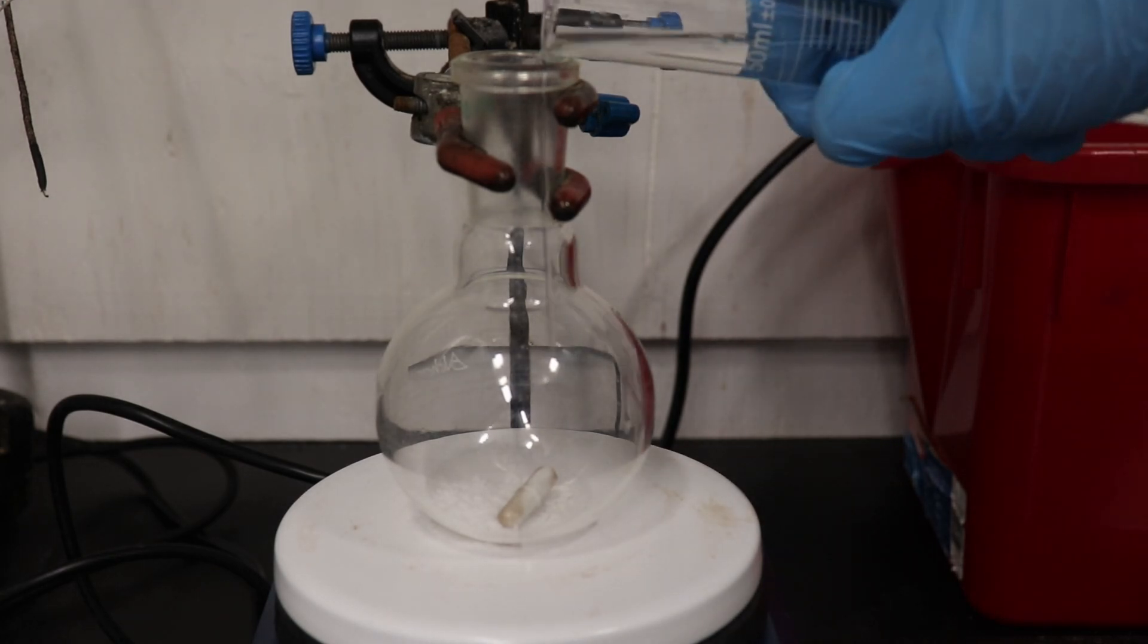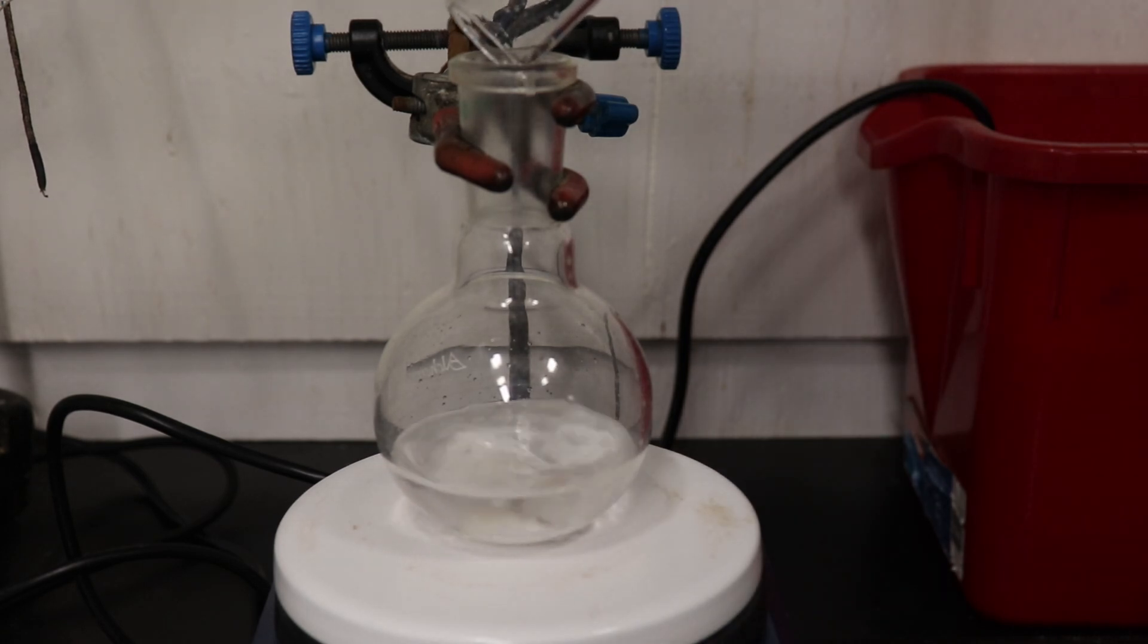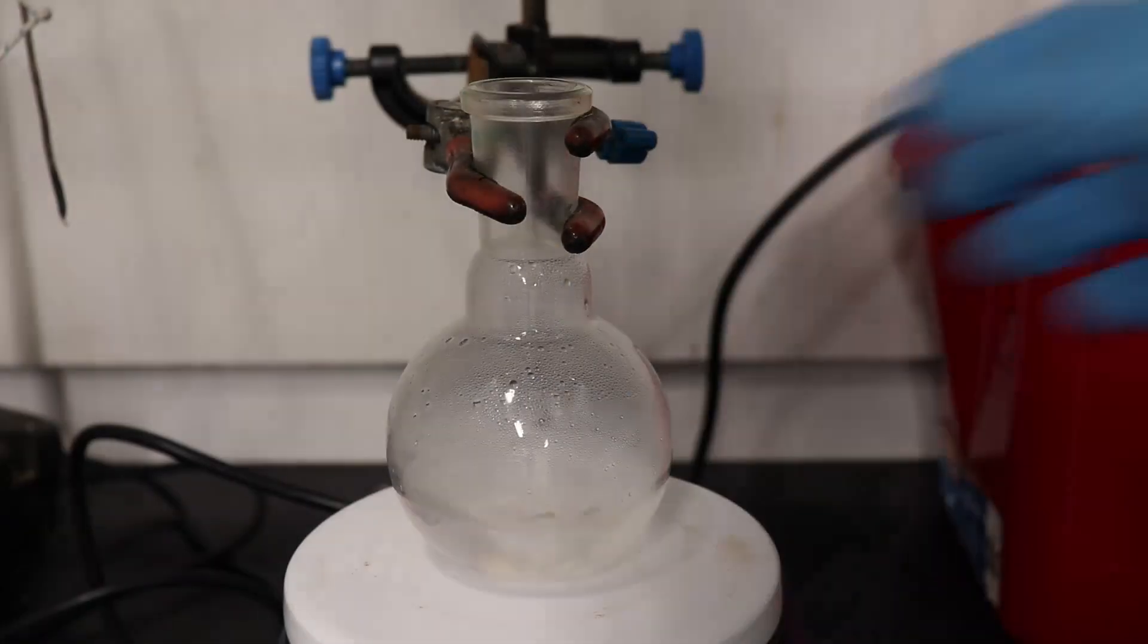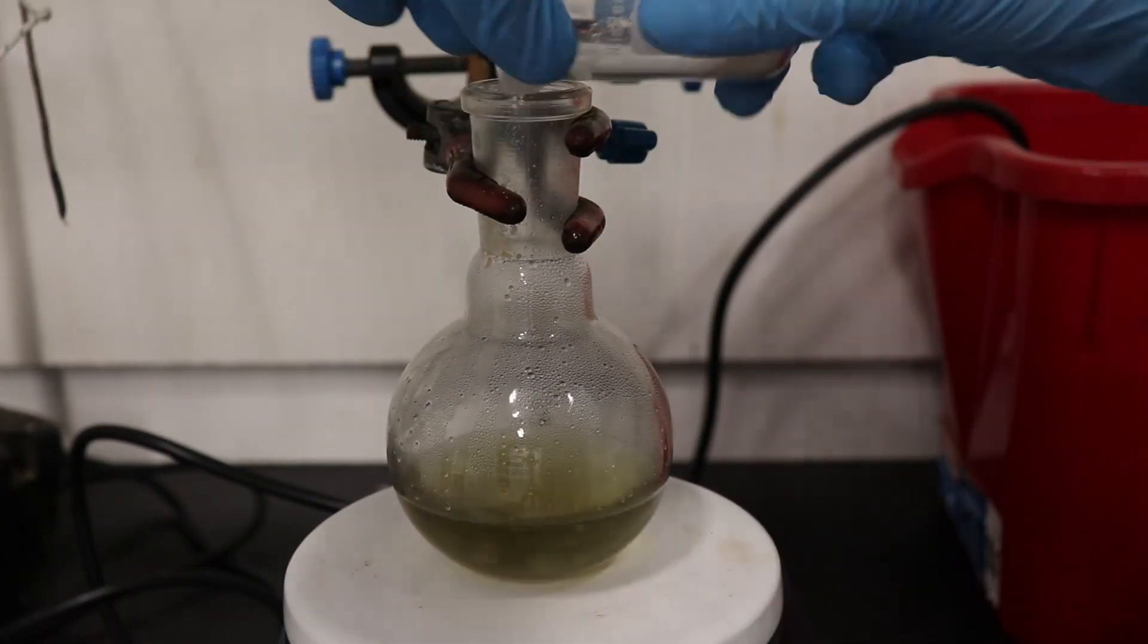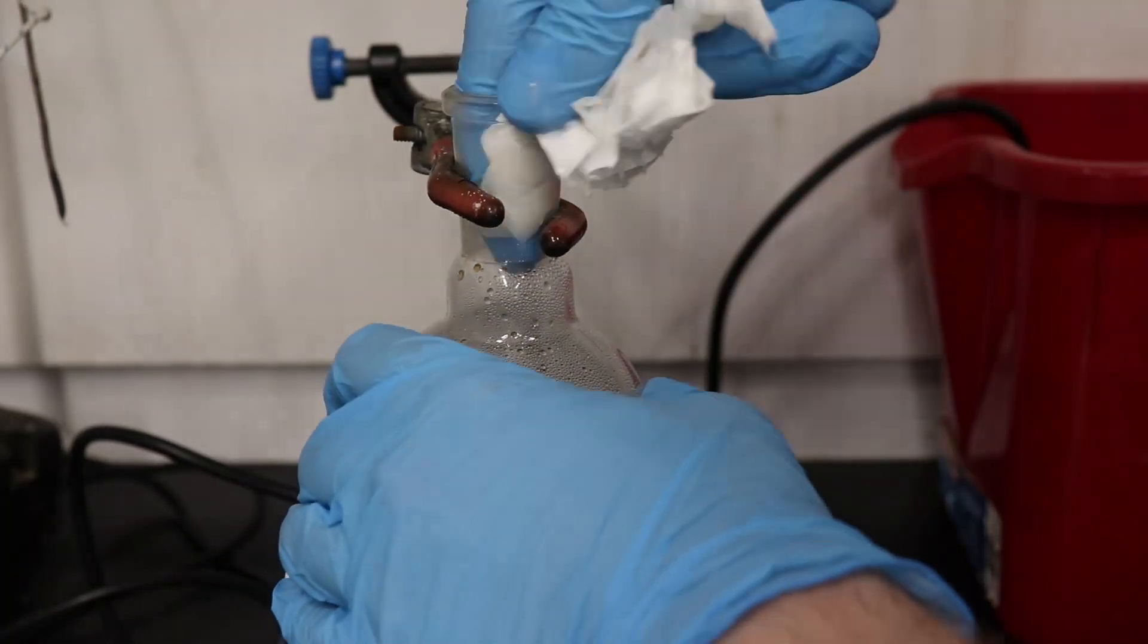To begin, 2.2 grams of potassium hydroxide was weighed out and added to a flask. Then 40 milliliters of methanol was added, and the mixture was stirred until completely dissolved. Next, 5 grams of 2-napthol was added and allowed to completely dissolve. Then the solution was allowed to cool back down to room temperature.